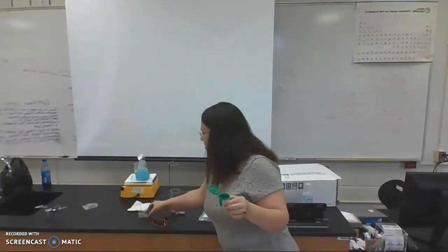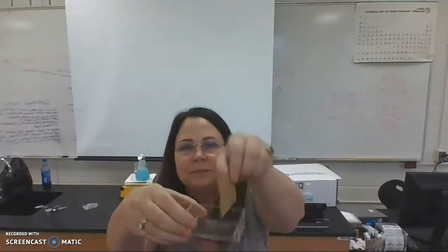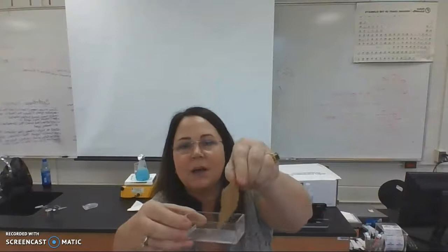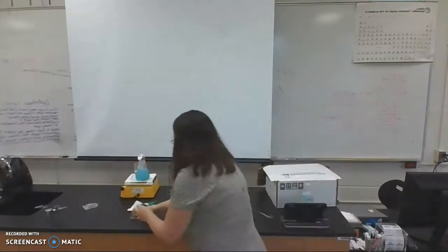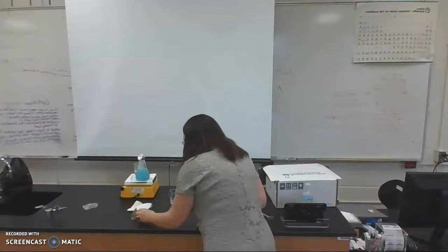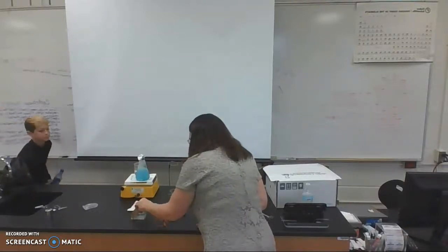This is the gel box, and this is the comb that goes in the box. The comb is going to make little holes inside of the gel. You're going to pour this as soon as it liquefies into your box. All of it.